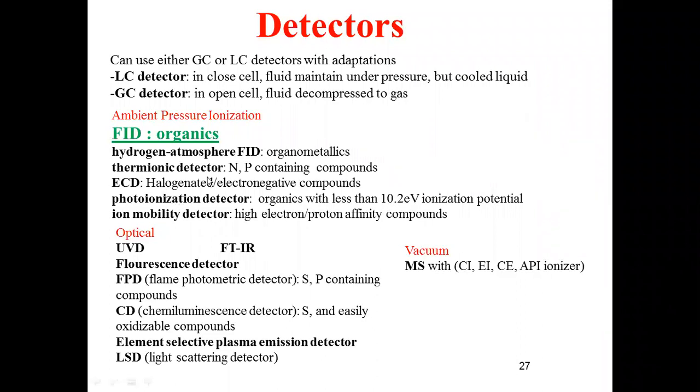Similarly, the thermionic detector is going to function based on the principle of thermal energy. An electron capture detector is going to function based on the principle of capturing of the electron. As a result of the electron capture, there will be a deflection in the current in the presence of the solute. And this deflection will be measured between the mobile phase and the mobile phase in the presence of the solute.